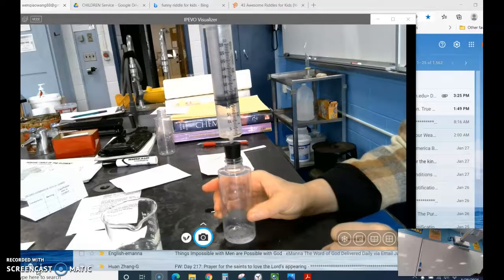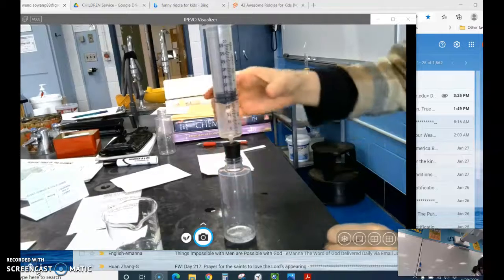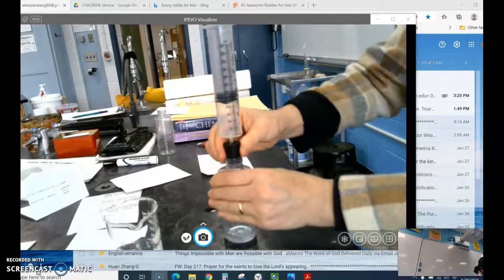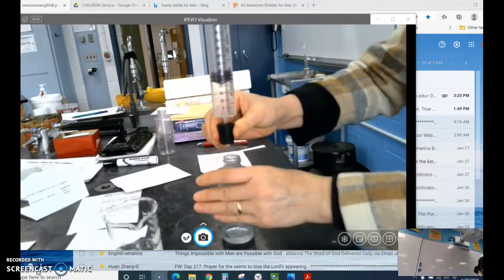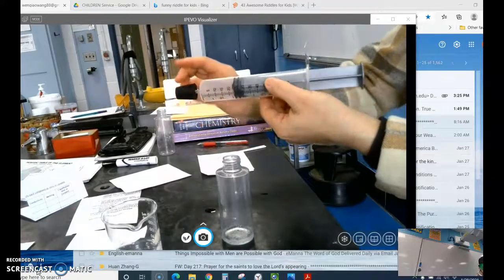Okay, I think it's kind of stopped. Yeah, I pretty much think that this is stopped. So we are going to read this first one together, and then the rest you would read on your own. Okay? Okay, I'm going to stop this one. So I just take this one out. Okay. And then I'm not touching the top part, so it's upside down so you can read this one carefully.